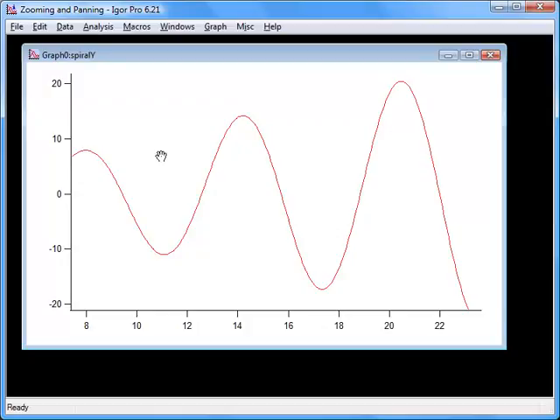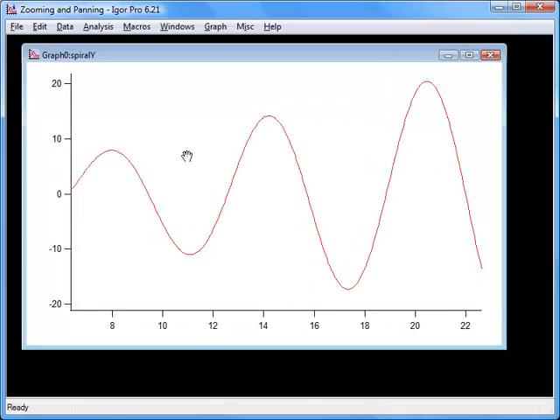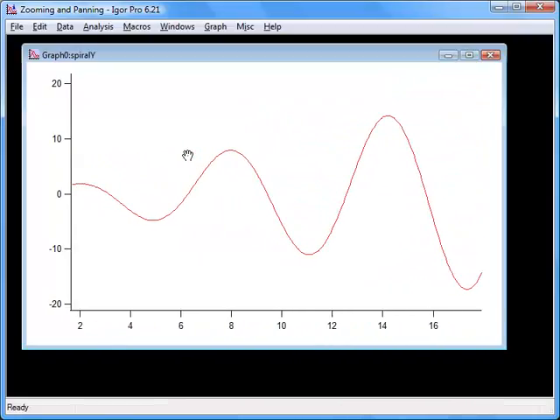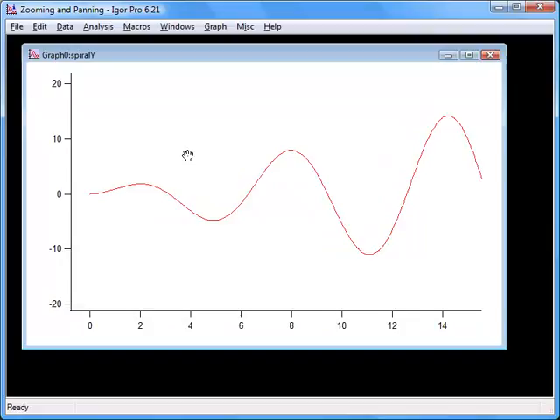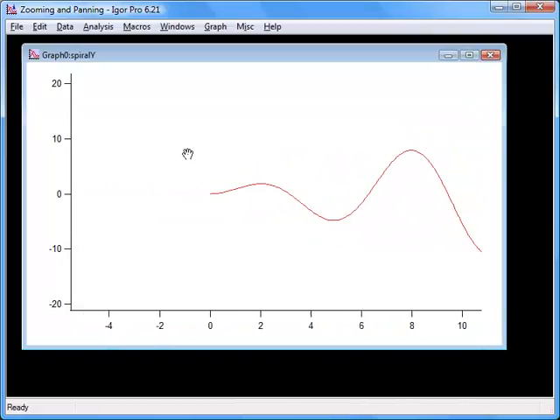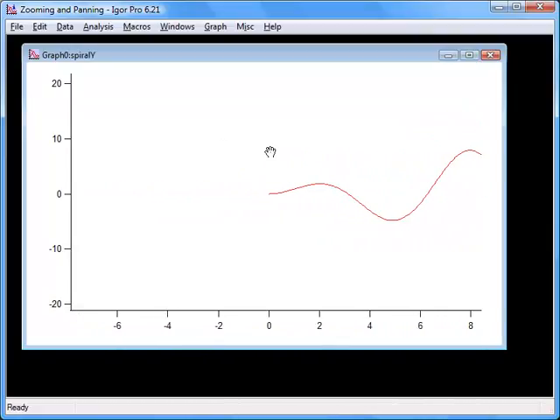While pressing Option on a Macintosh or Alt on a Windows computer, click the middle of the graph and gently fling it to the right. The graph will continue to pan until you click to stop it.